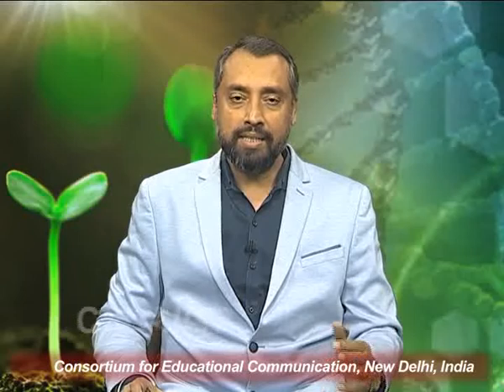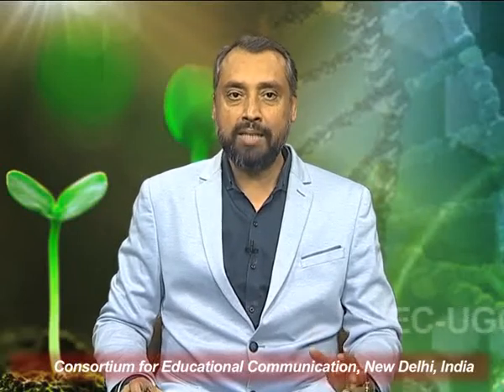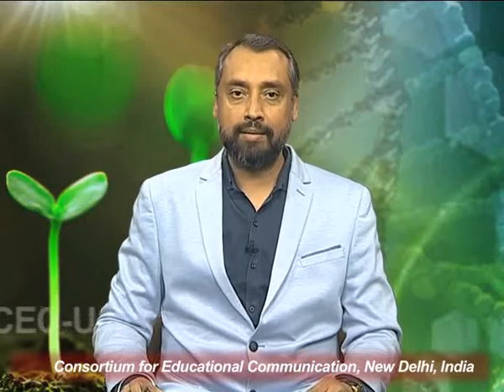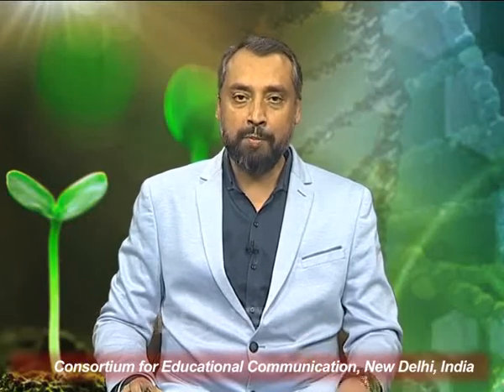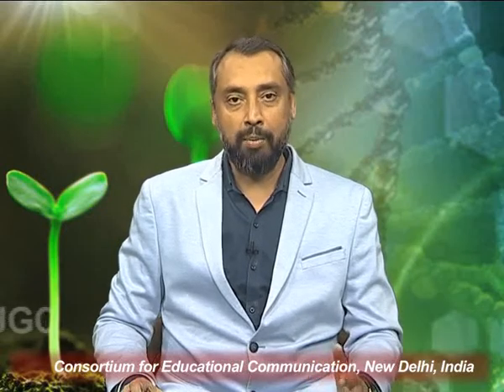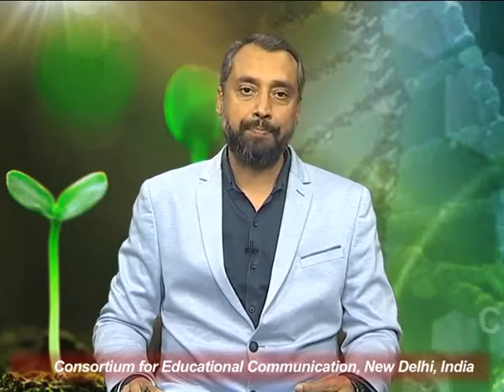So in this series of lectures, we will be discussing the basic principles of these instruments, the working principle also, and the uses and limitations of these instruments. This will enable us to handle these equipments in a much more skilled manner in our laboratory conditions.